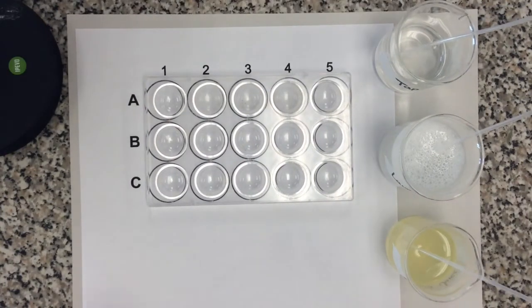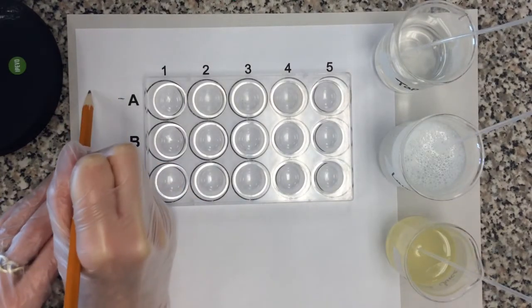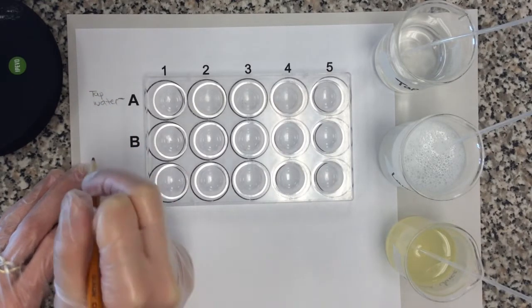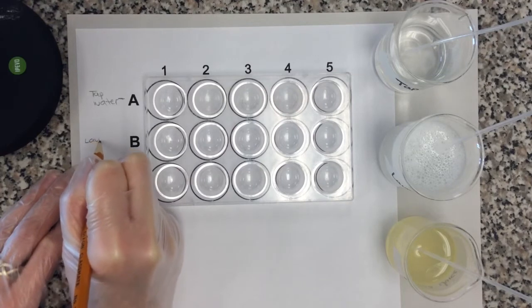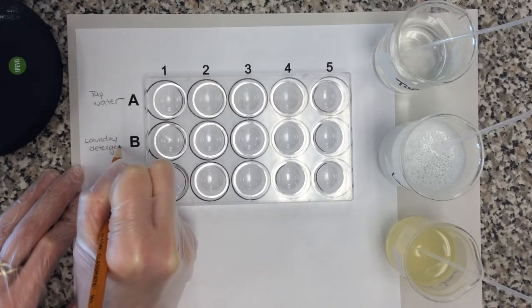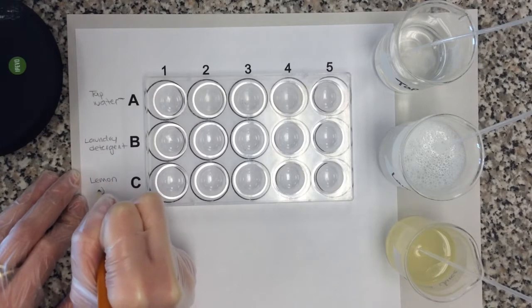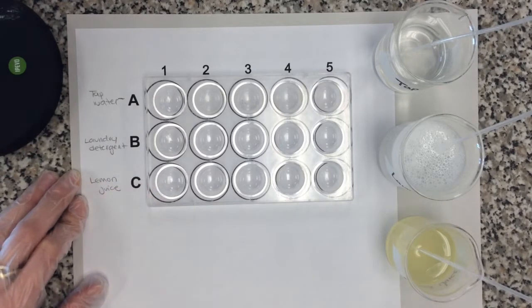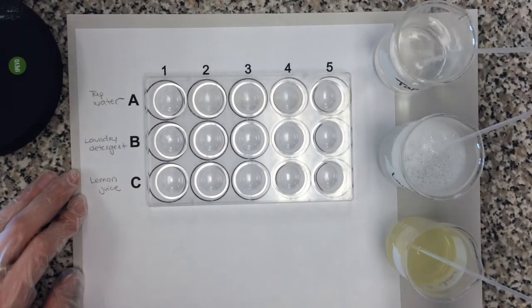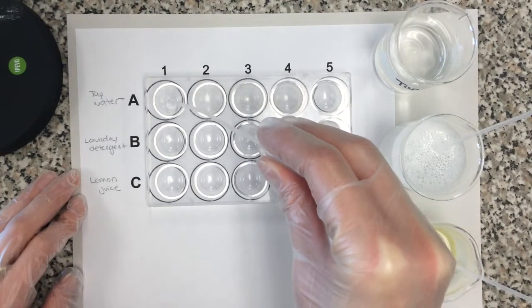Okay. So in order for me to remember this, I'm just going to put a small note here saying that A is tap water, B is laundry detergent, and C is lemon juice. Okay, so I'm going to go ahead and put 5 drops using my pipette of each substance in each row of my well plate.